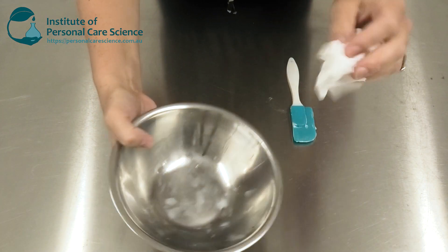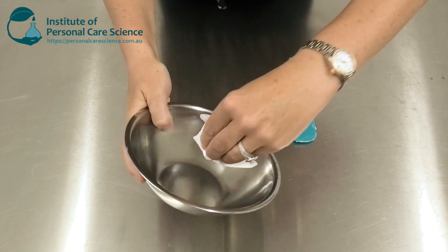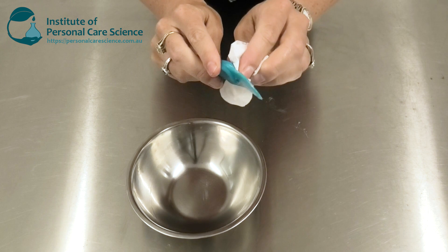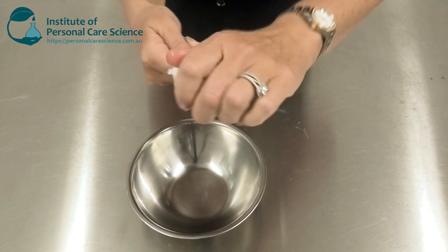First of all, if you have really oily equipment, make sure you wipe these over with paper towel or other tissue to remove the excess oil. It's going to make cleaning at the next step a lot easier if you've got the excess oil removed from your equipment.